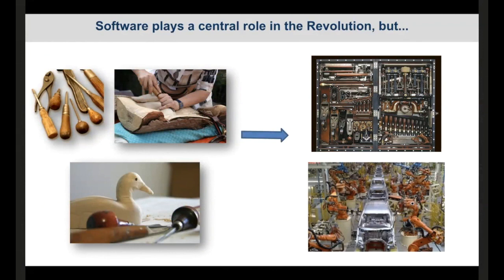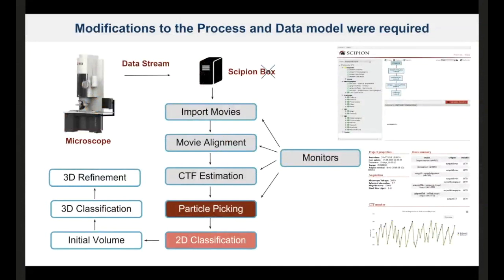Nowadays, this has changed a lot. We have now many more software packages. There are many more tools. And of course, we want more and more automation. We are buying all these very expensive instruments, and then we want to have high throughput. So this has led to new changes we have made to the whole framework, trying to adapt to this new requirement.